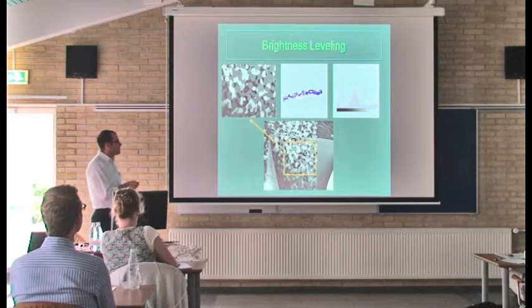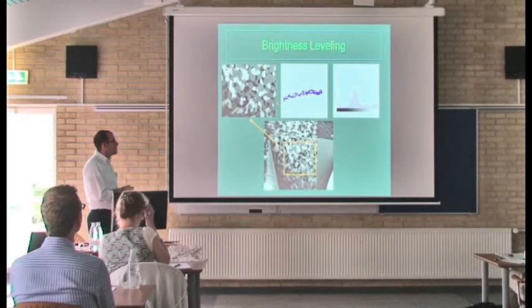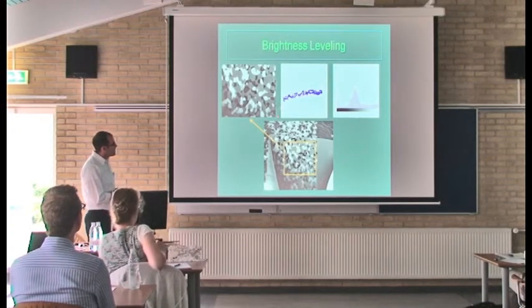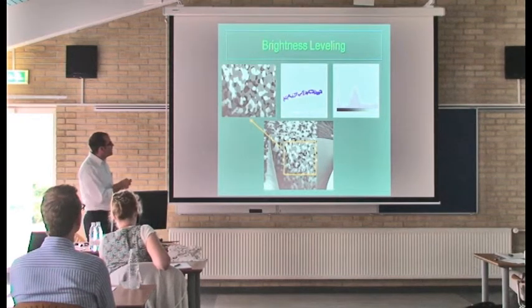And in the same manner, you can throw out the high error points that are away from that, and then refit. And you can basically see that as you go, this is row number here. As you go down the image or up the image, the general brightness of the gray phase is changing.